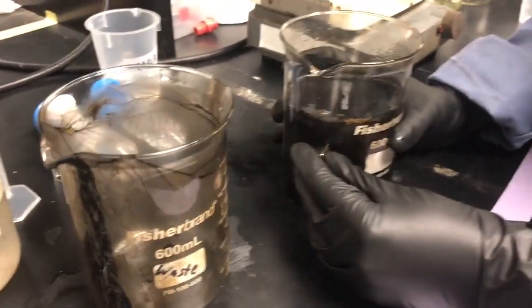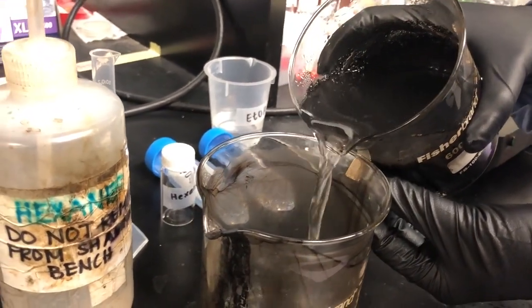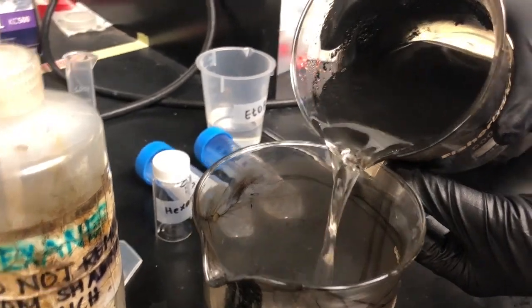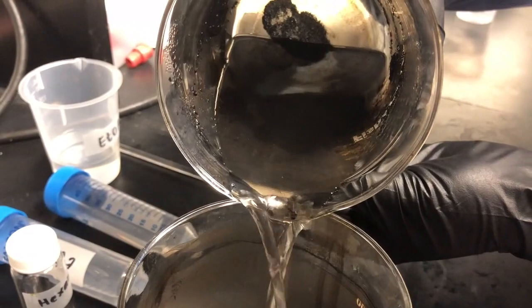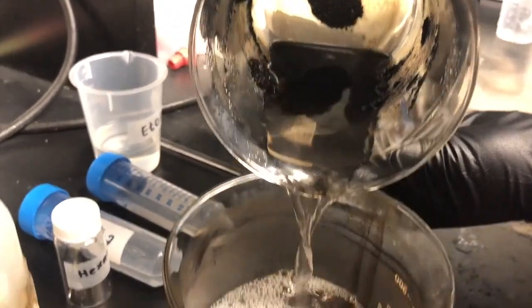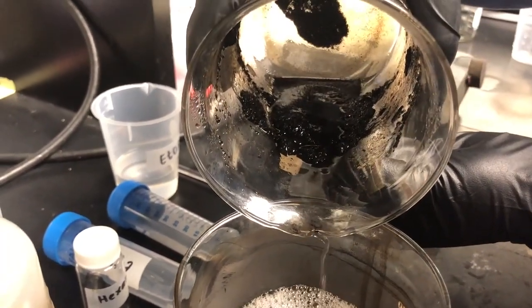All right, so now we should only spend about a minute, which it's been roughly, to extract them. And you can see the water is going to be dumped out, whereas the magnetic particles are being collected on the magnet, which is held at the bottom of the beaker. Now, again, quality, not quantity. So we are losing a little bit, and if we even lost more, it'd be totally fine.